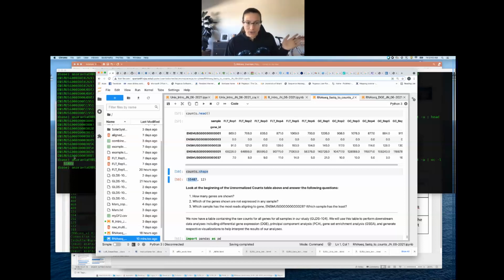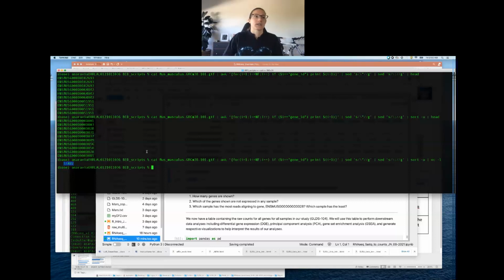I was thinking coding genes, but of course there are more than just coding genes annotated. We also have pseudogenes, microRNAs, long non-coding RNAs. There are several different types of other transcripts or RNAs that are annotated, and not just the coding ones. So I'm sorry for that wrong number, but I still did remember that there were some mapping to the same gene symbol.